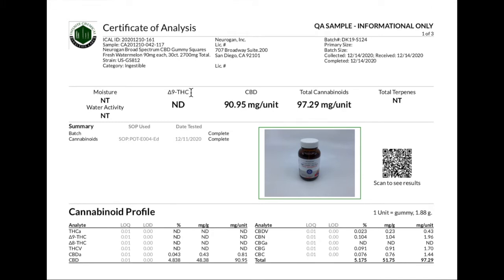Once you've confirmed you're looking at the right product COA, take a look at the second row of the COA under the section titled Delta 9 THC. This is an important section for a few reasons. If you're purchasing a THC-free broad spectrum product, this section will say ND, which stands for not detected. Our whole plant broad spectrum products have been slow artisan filtered and contain such low levels of THC that they do not register in a lab test. As a note, if you're looking at the lab results for a full spectrum product, this section will convey a low milligram amount of THC, but always under the legal limit of 0.3 percent THC in a single product.